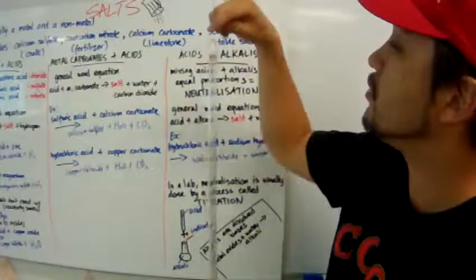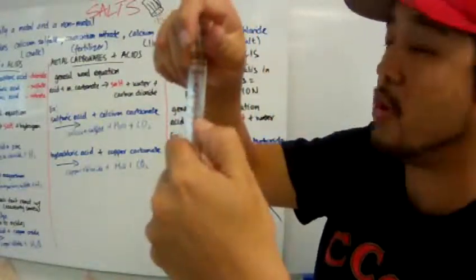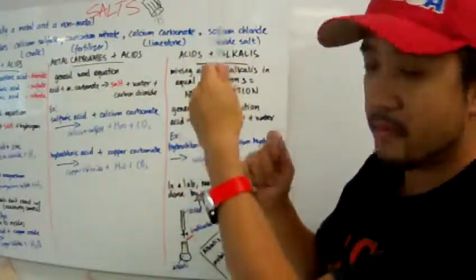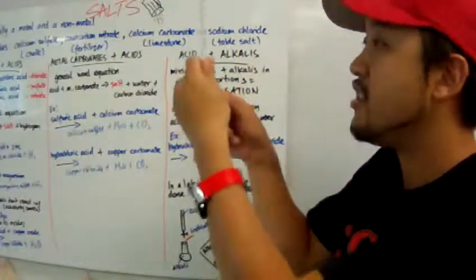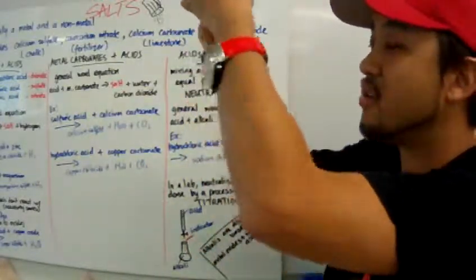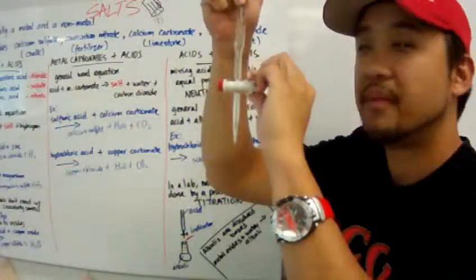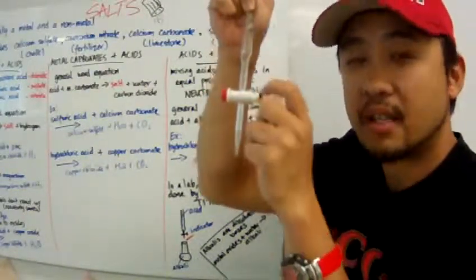Fill up the acid to the top until you reach the 0 point mark, and then you put a couple of drops of indicator into the reaction vessel. Then you titrate by adding drops of acid into the alkali.